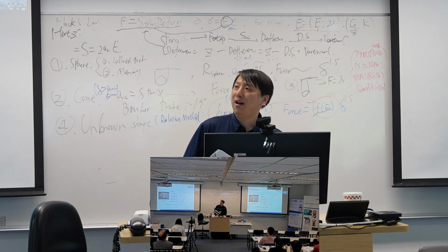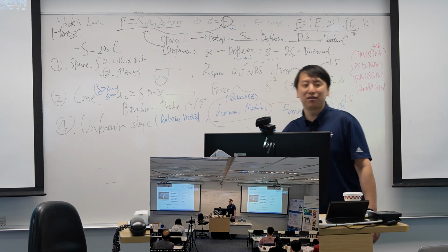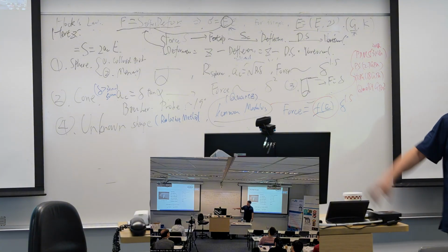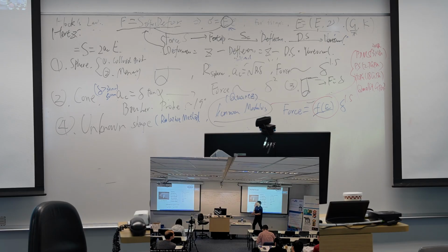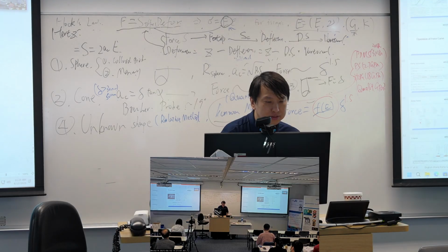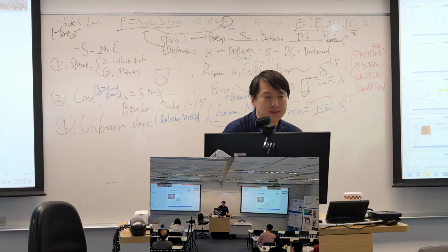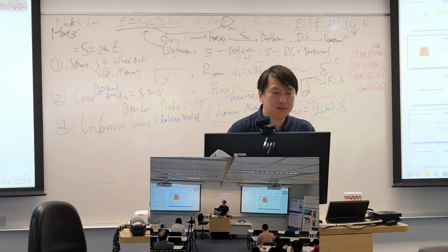Okay, we have about half an hour, so we will jump into Bruker's technique, the so-called PeakForce QNM. PeakForce QNM just uses this theory to capture a distribution of modulus in a quicker way. The next part of my slides is just about the software, which we will demonstrate in the hands-on session.